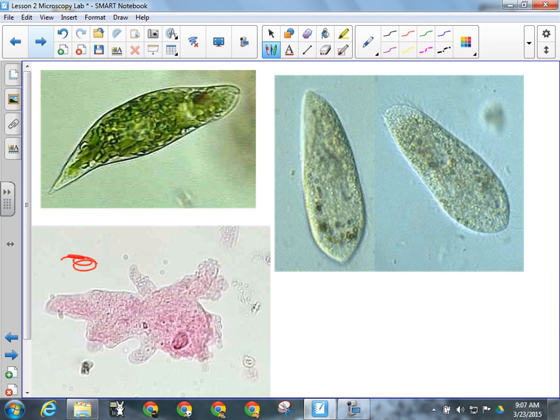The second one you look at should be the paramecium. On some of the slides, the paramecium are greenish, but on some of our slides, they're pink and purple. All right, and there's actually a couple of slides where they managed to stain them so the different genders showed up as different colors. So there's brown and purple and pink. I know you're counting that and going, that's too many genders, but paramecium are different. So yeah, there's that kind of thing there.